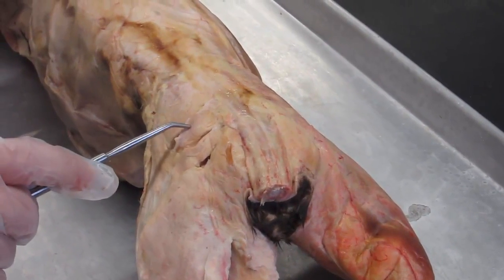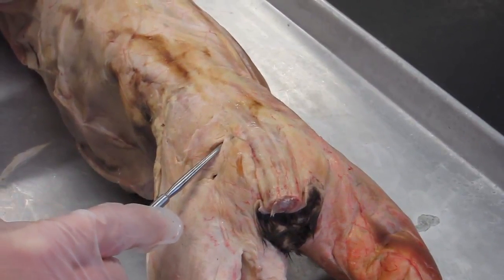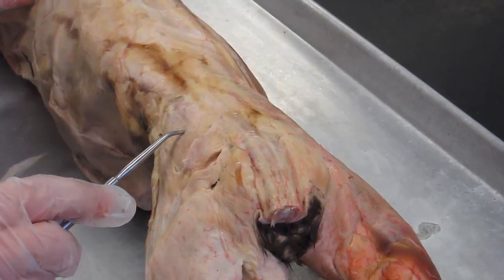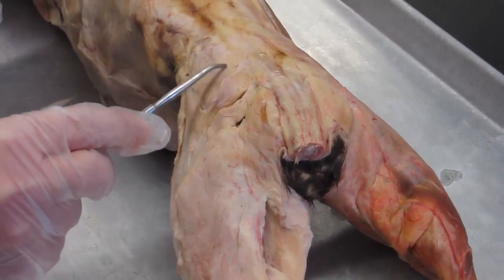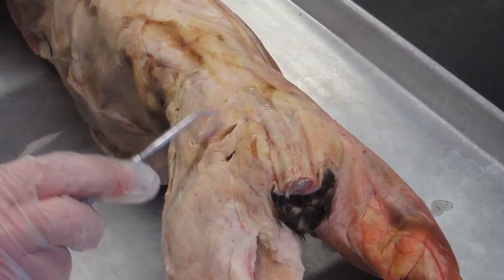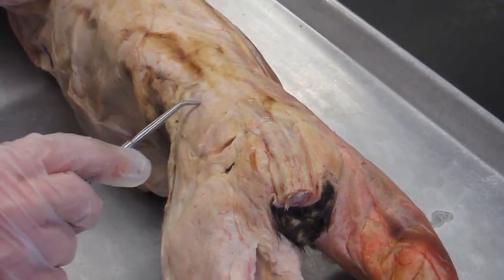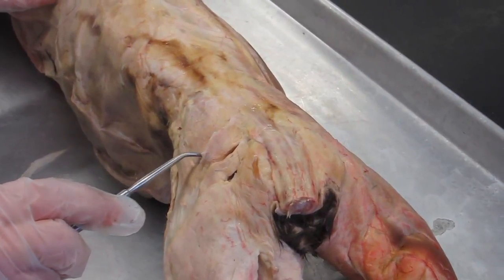In the cat, the size difference is the opposite. The gluteus medius is the larger of the two muscles in the cat, and we can clearly see most of the gluteus medius even if the gluteus maximus is in position. So the gluteus maximus doesn't cover as much of the gluteus medius as it does in the human.